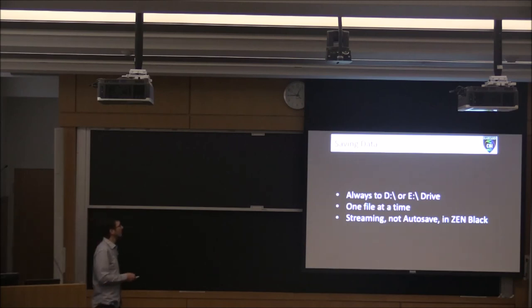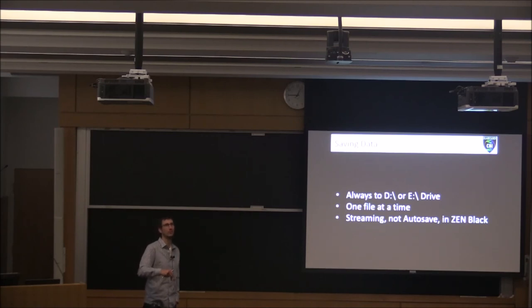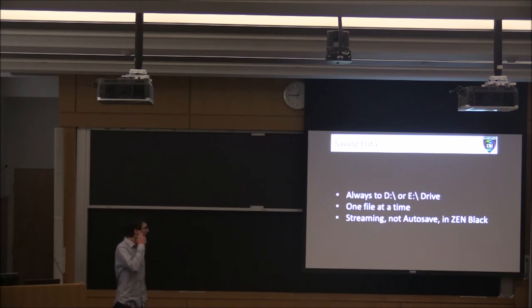When saving your data, always save to the D drive — each of our workstations has a D drive. Make sure you're always saving there, not to the C drive. If we get too much data on the C drive it becomes unstable, and that's where Zen lives — we want Zen to be as stable as possible. Always save one file at a time; if you try to save multiple large files at once, Zen often doesn't handle that well. And when using Zen Black, don't use the autosave function — use the streaming function. This helps keep the computer stable and helps ensure your data is saved properly.